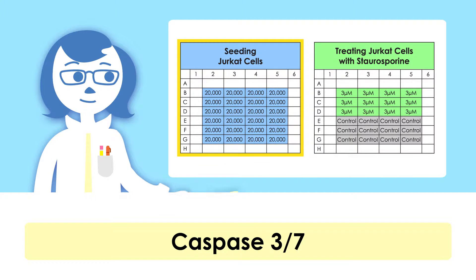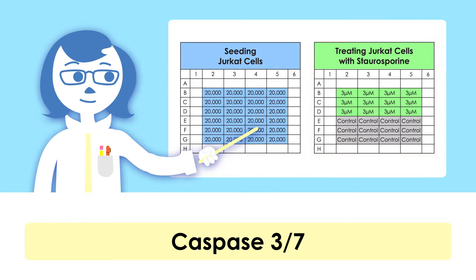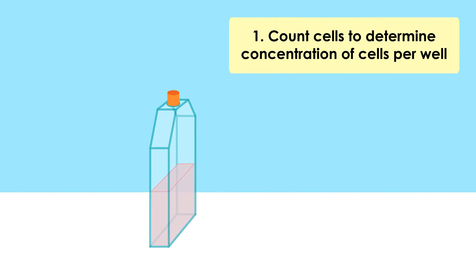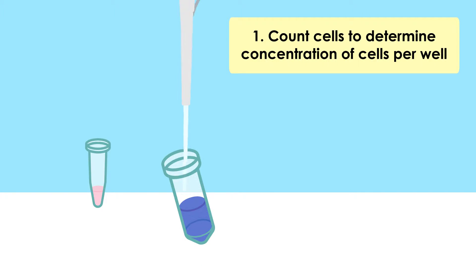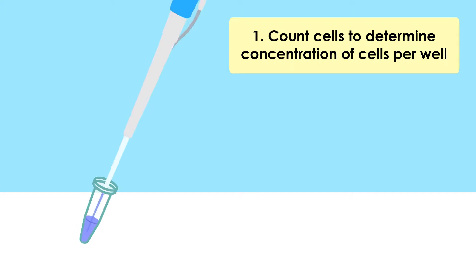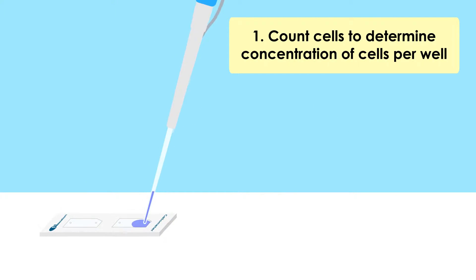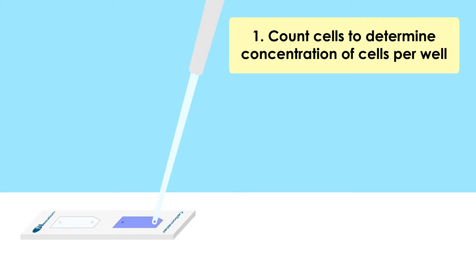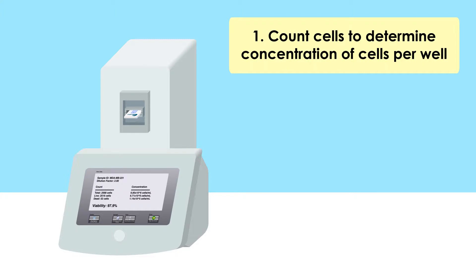Today, I'll show you an apoptosis assay that was performed using suspension Jurkat cells that were treated with 3-micromolar staurosporine. To achieve the best accuracy of your cell plating, first measure the cell concentration by using a Cellometer automated cell counter. Mix 20 microliters of cell sample and 20 microliters of trypan blue. Load 20 microliters of stained sample into the Cellometer chamber slide and perform a cell count to acquire cell number, concentration, and viability of your sample.